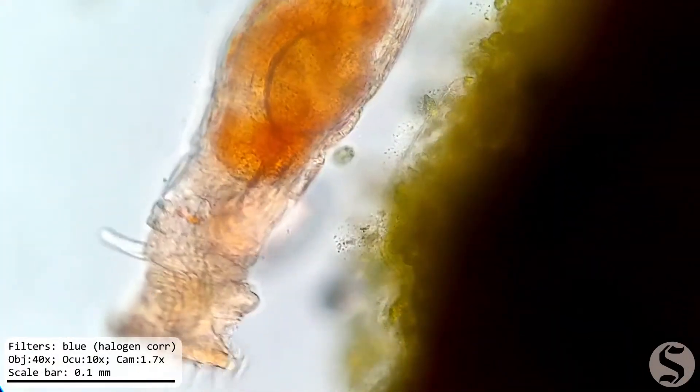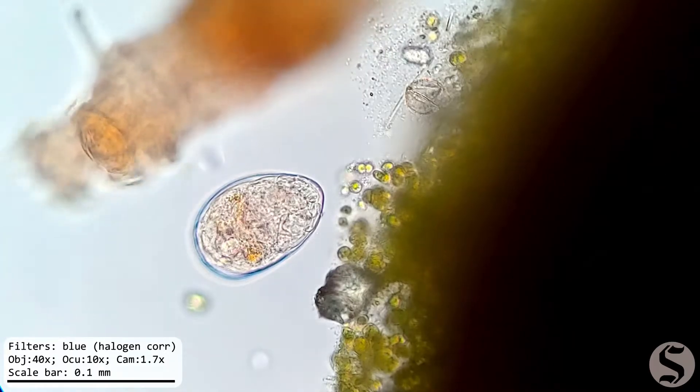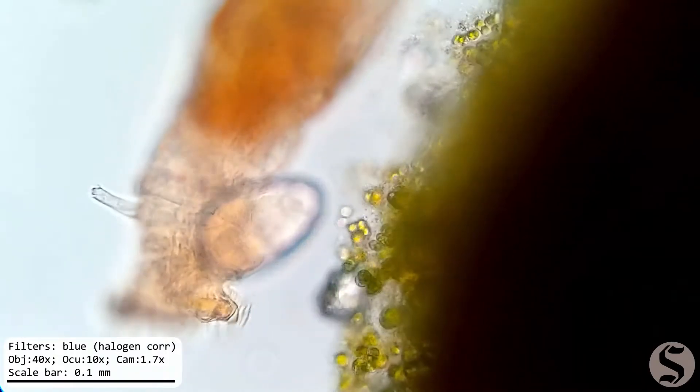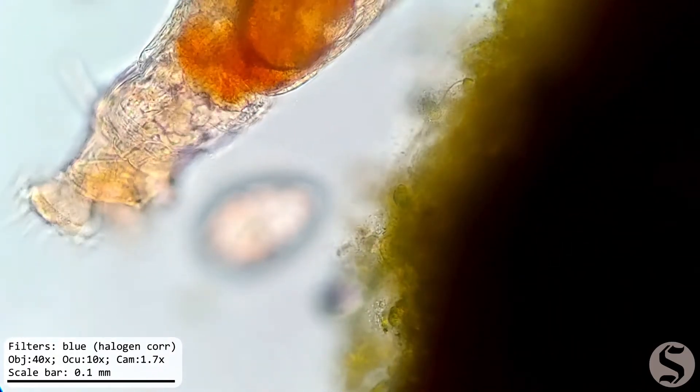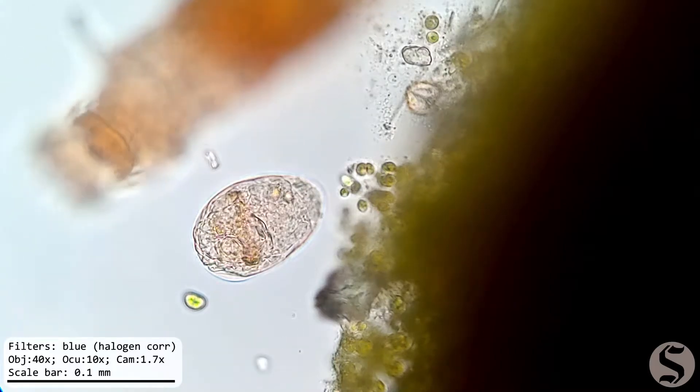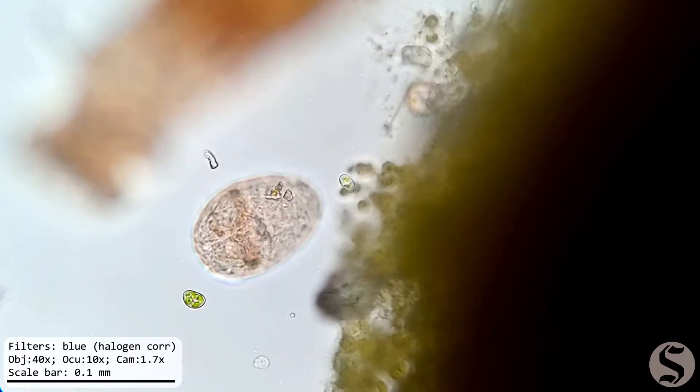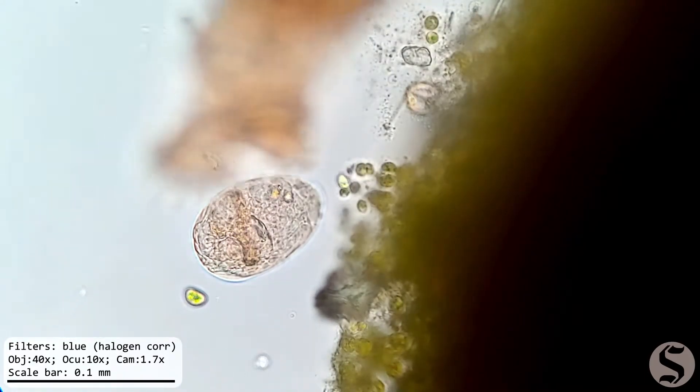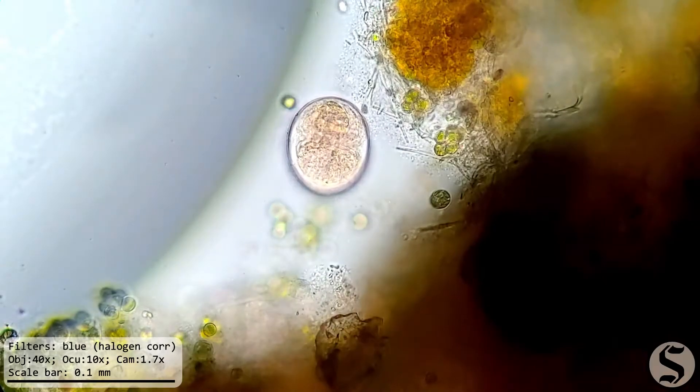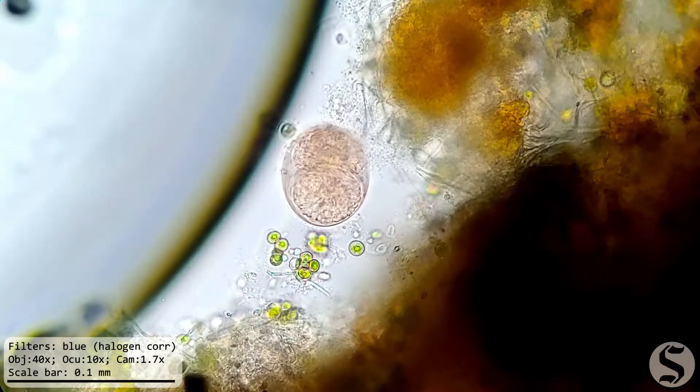But here I noticed there was something behind it, and this looks like some kind of egg or cyst. There's definitely some movement inside of it. And here's some other egg or cyst, also with something moving inside of it and either growing or rehydrating. That's pretty neat.